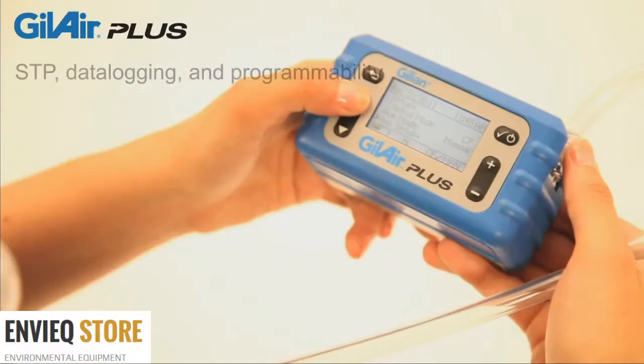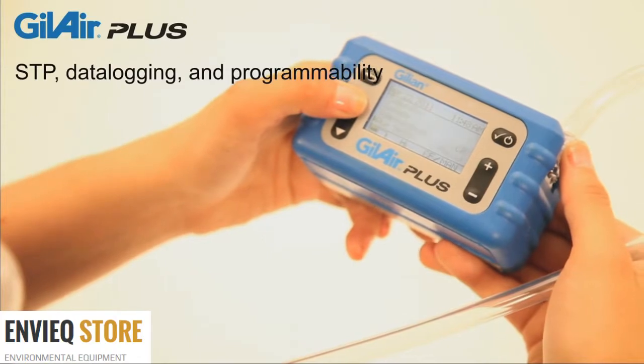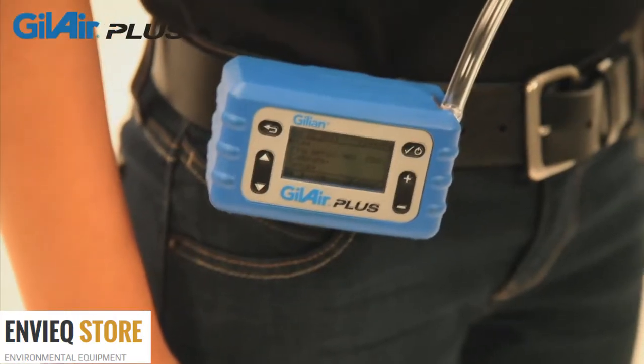GillAir Plus offers standard temperature and pressure correction, data logging, programmability, a real-time clock, and selectable automatic fault recovery.